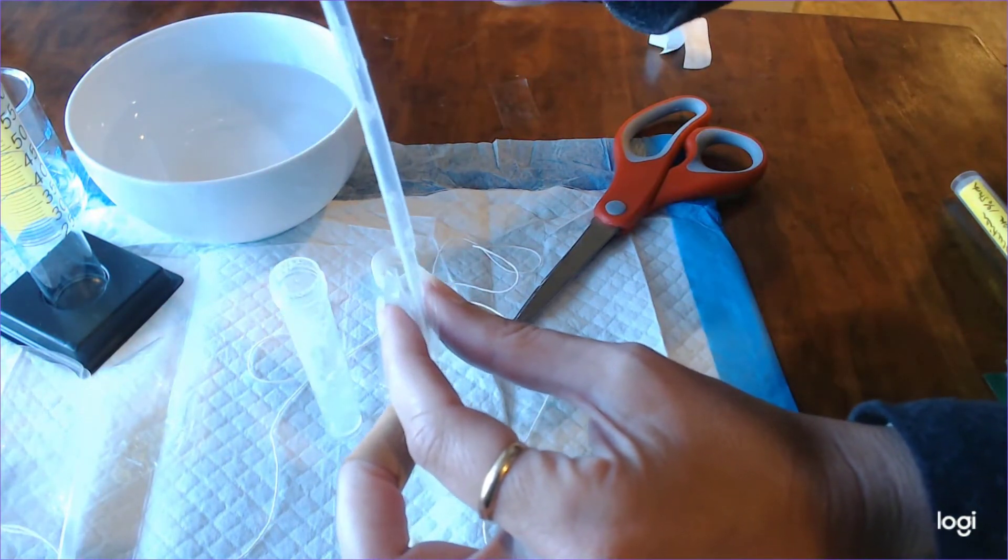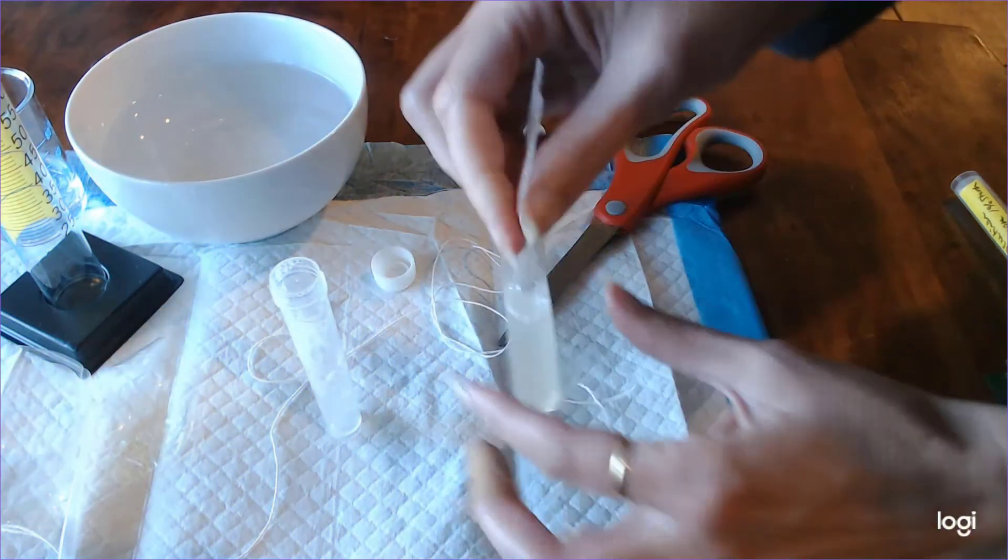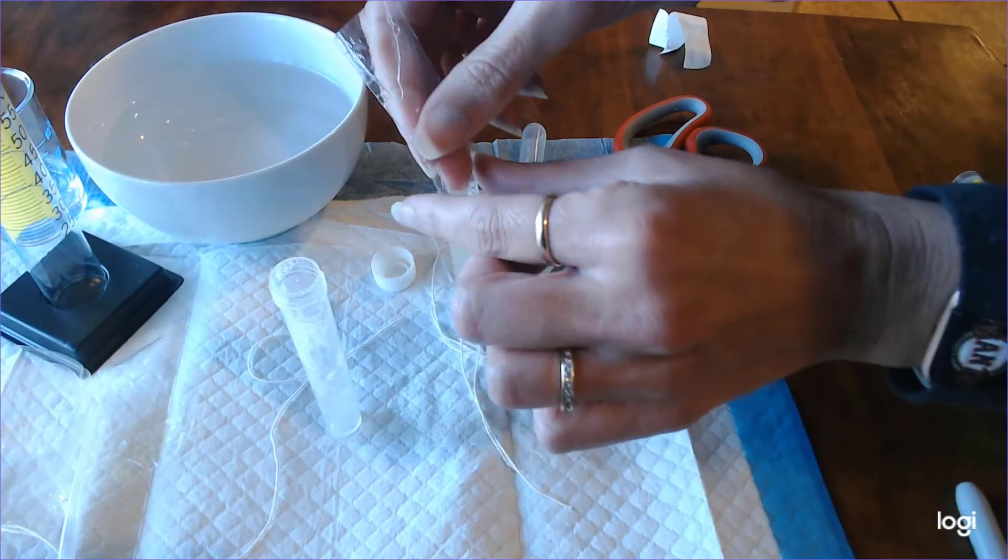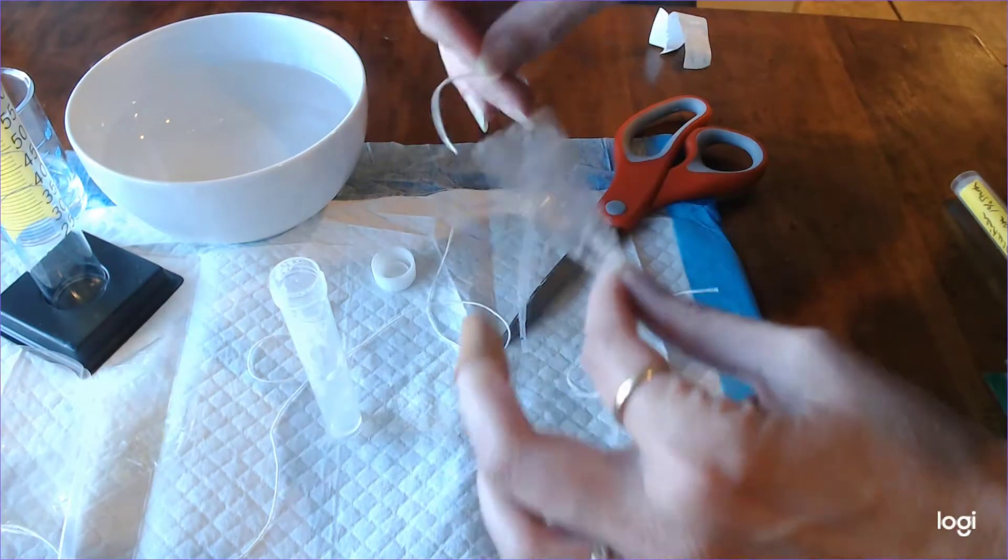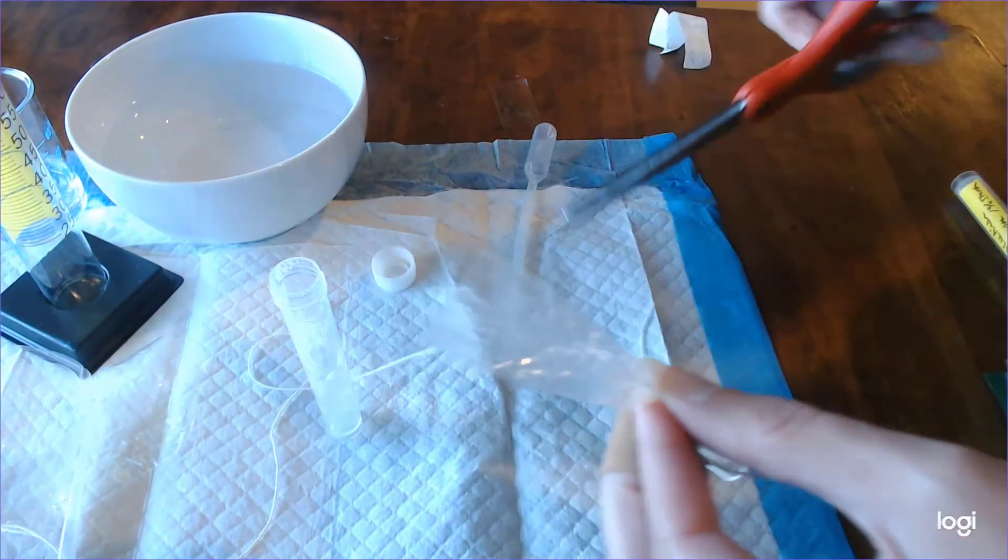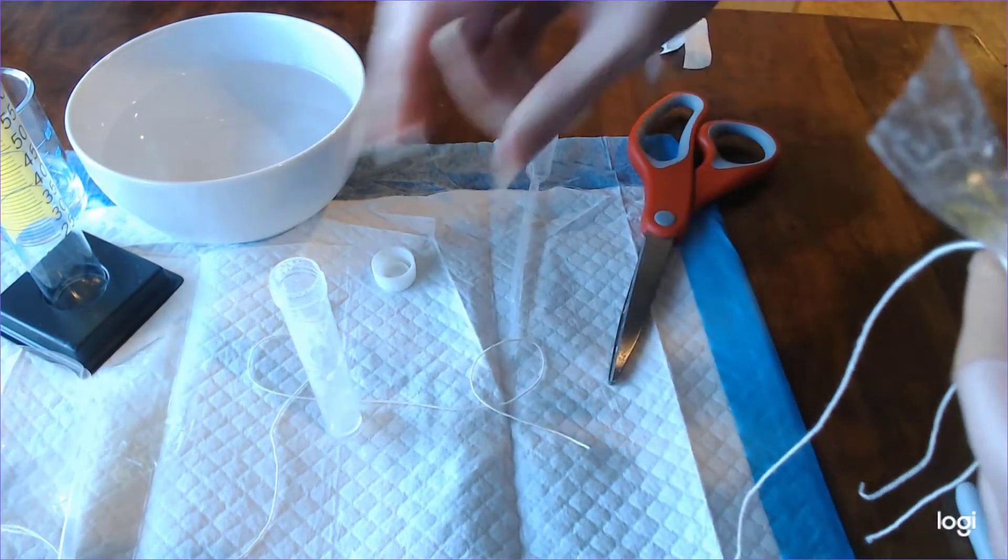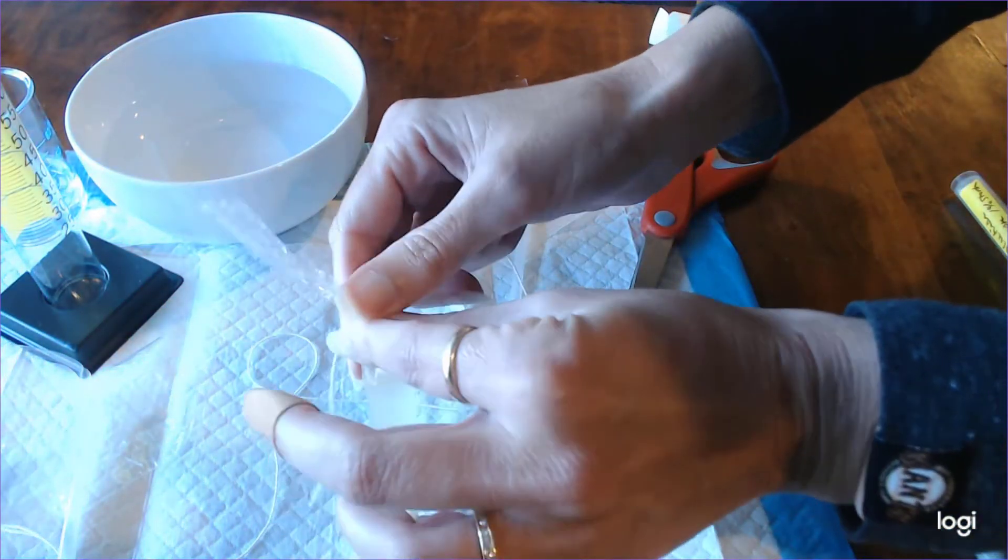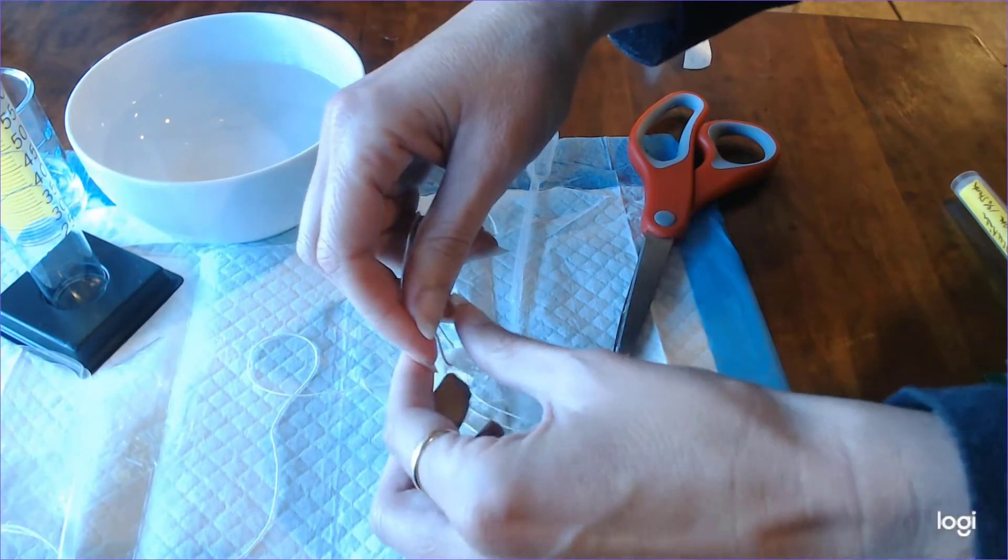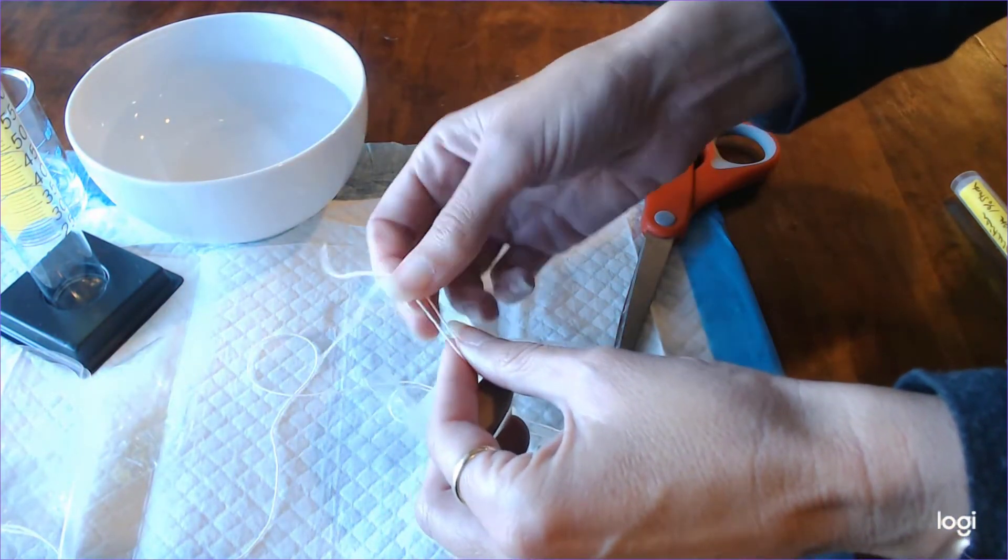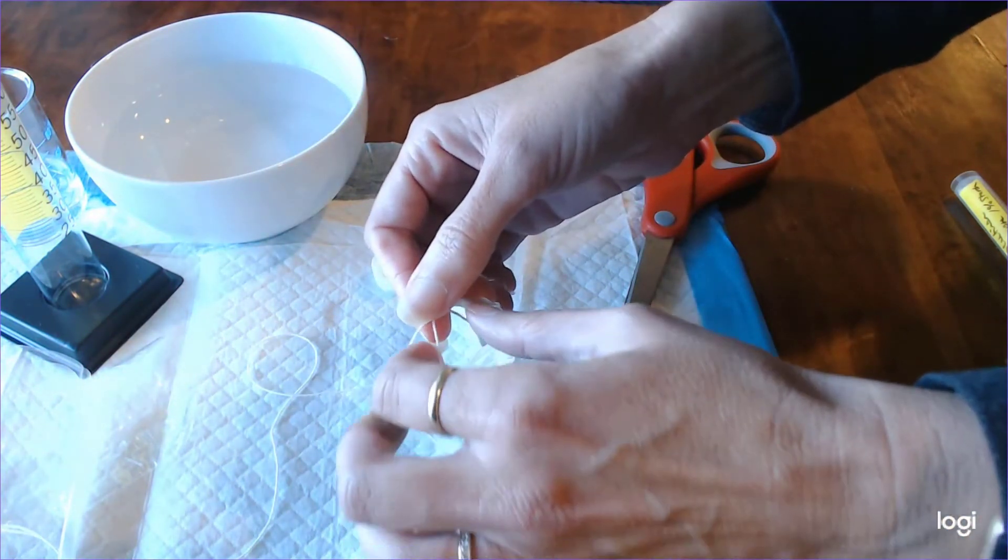Okay you have transferred approximately 10 mils of solution into that dialysis tubing and now what we're going to do is we are going to tie off the other end. Now you'll want to tie off the other end like you did the first part, so you're going to do a pretty tight a couple knots, but you want to tie it just above where the solution ends.